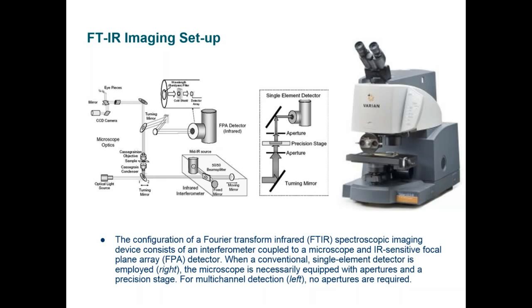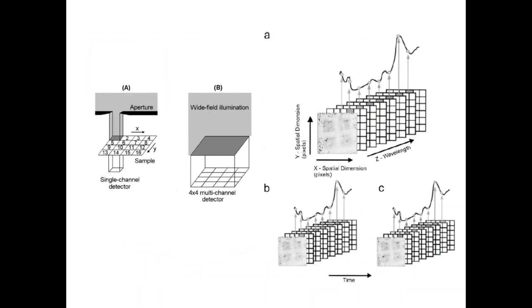It's essentially an IR detector that captures the spectra over a wide area of a pixelated detector. With that definition, one can use it for IR mapping of an optical image.